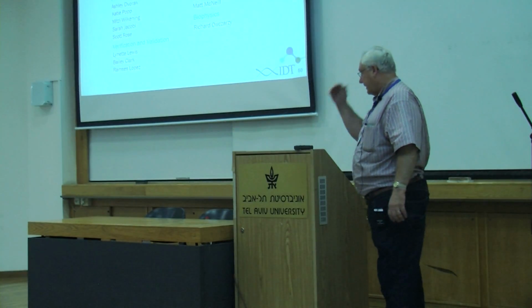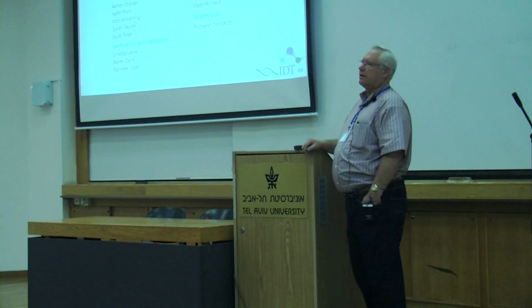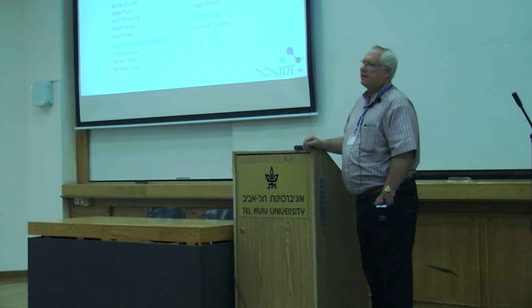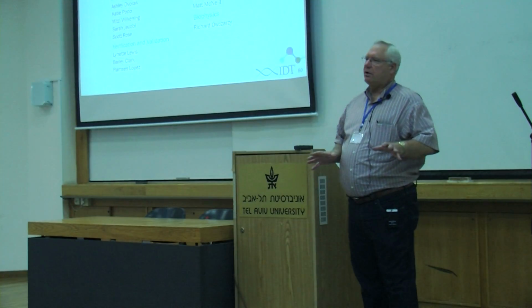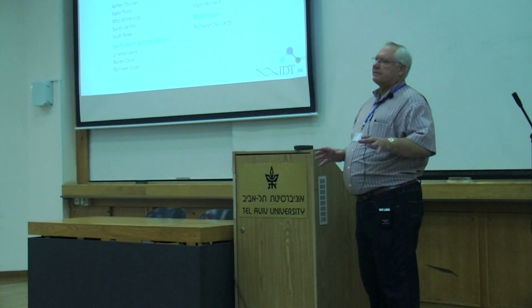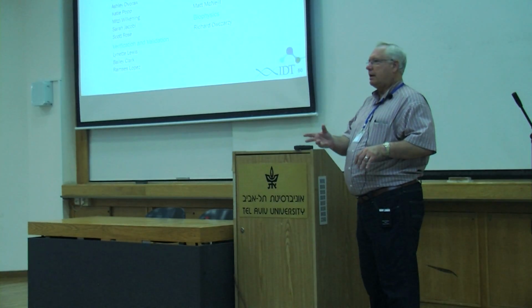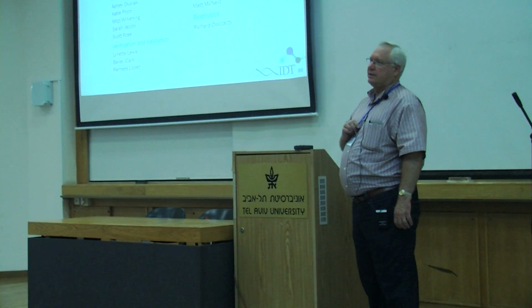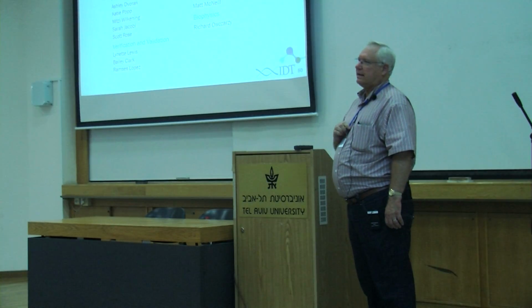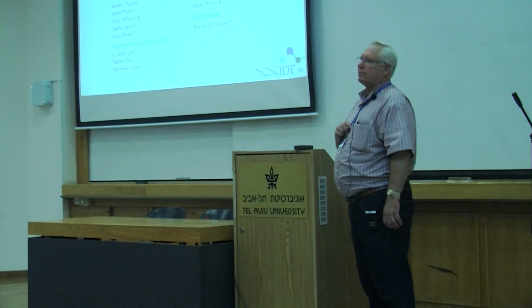Then, of course, you've got unbiased detection of off-target events. And right now, for live cell work, I think the best method is GUIDE-seq out of the Joung Lab. But my understanding is that there's a new, better unbiased CRISPR off-target sequencing method for NGS coming out that's not looking at live cells, it's looking at the cutting patterns in vitro. Both Joung and Caribou have submitted papers to Nature Biotech that are under evaluation, giving two different methods for doing that in vitro that give you a lot greater depth of penetration to off-target sites than the live cell approaches.